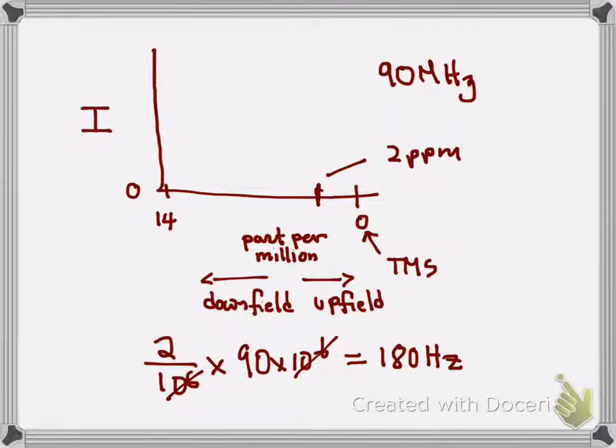It's an arbitrary, relative scale. It depends on how much sample. If I put a 10-fold concentrated sample and a 1-fold concentrated sample, the signals would be 10 times bigger. Like other spectroscopies, the signal intensity in NMR is proportional to the concentration of the atoms.